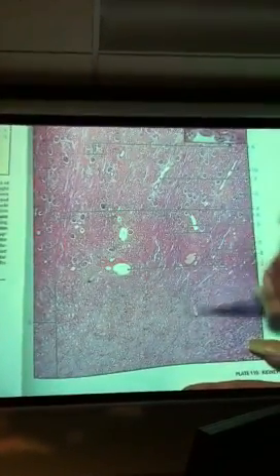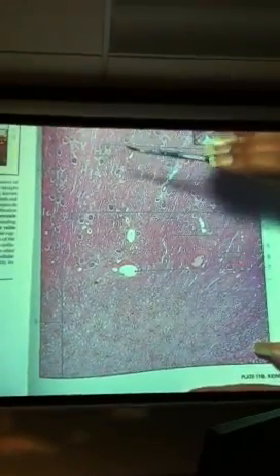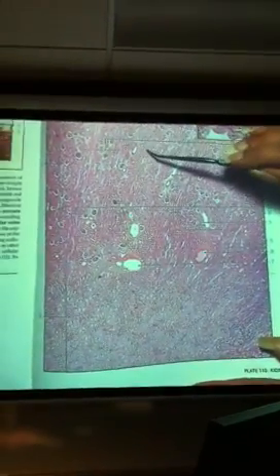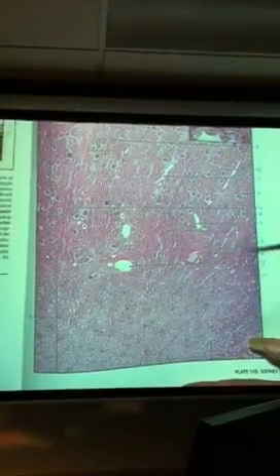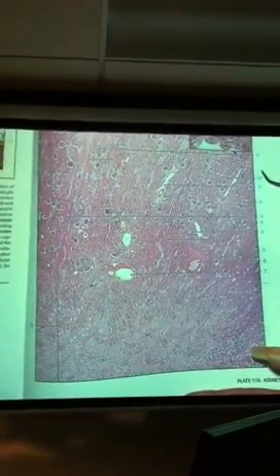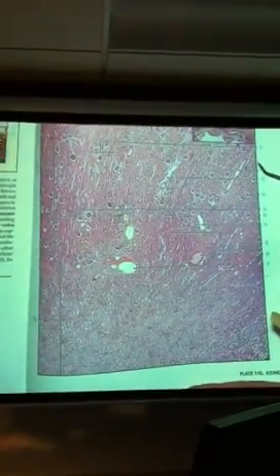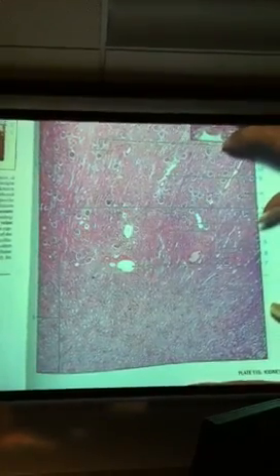So this bottom part would be the renal medulla, and this upper portion would be the renal cortex, because it has the renal corpuscles in it. Does that make sense? Yes. And that's everything on this slide. Let's see what you got.